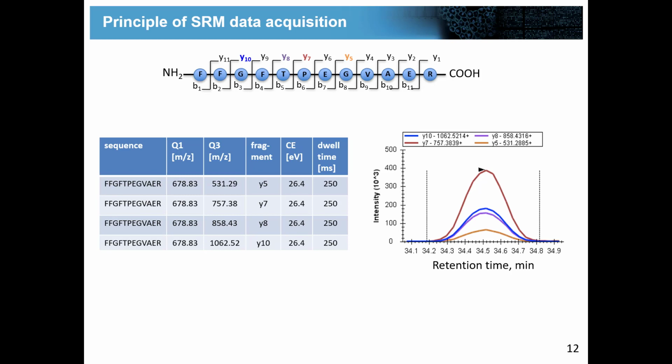You could, in theory, even have... usually you do this on precursor level, but you could even use different values for different transitions. Yeah, and it can make a lot of sense, even though it also means even more upfront optimization work if you want to optimize all of that.